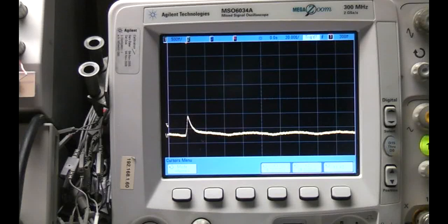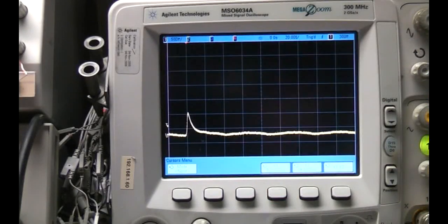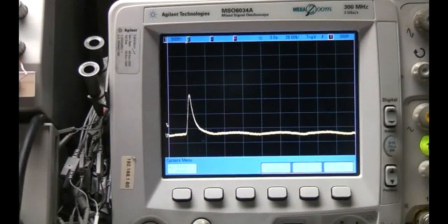This thing seems to be working - just picking up a lot of background particles and radiation. I've got a piece of uranium-paint dish that's a bit radioactive, so holding that in front. Because this has got a beryllium window it's quite sensitive to even quite soft particles - certainly more sensitive than a standard Geiger-Müller tube. You can see different pulse heights, and because this is a proportional tube the pulse height actually represents the energy of the particle it's detecting - so it's detecting all sorts of different particles with different energies, which is quite neat.